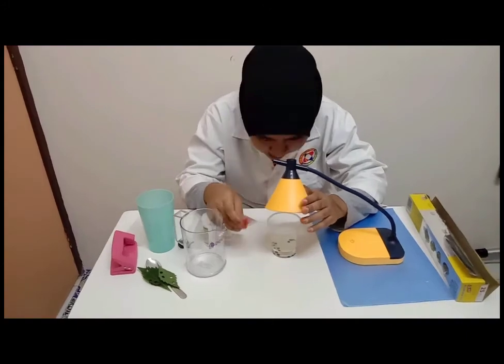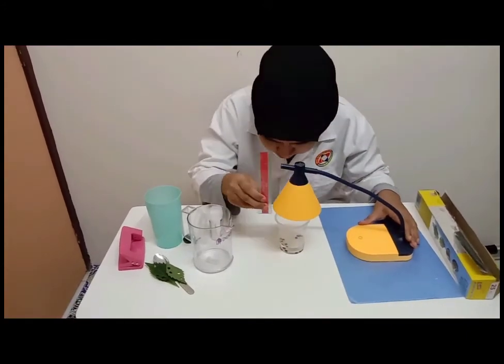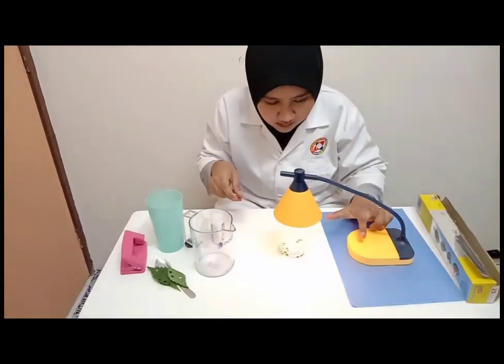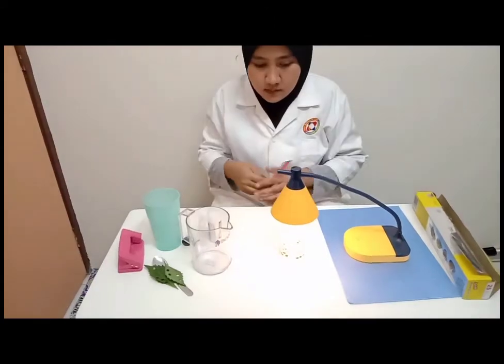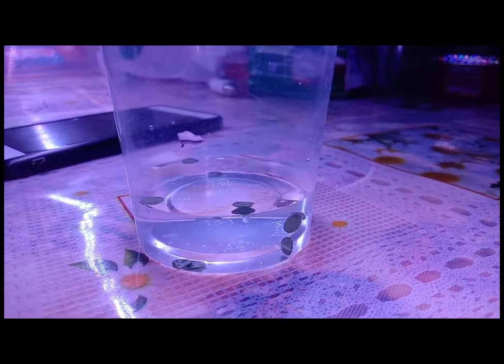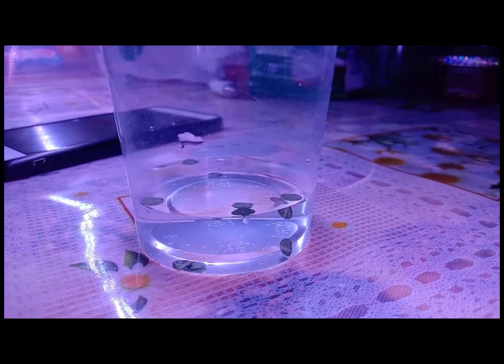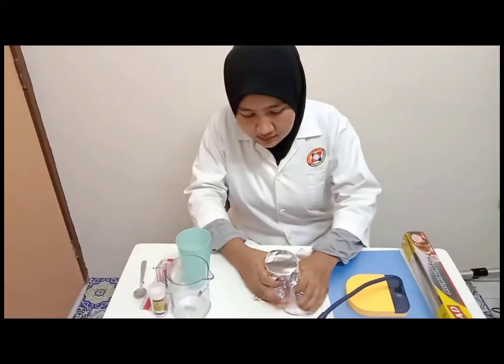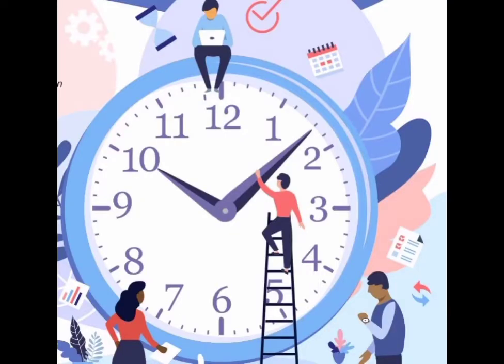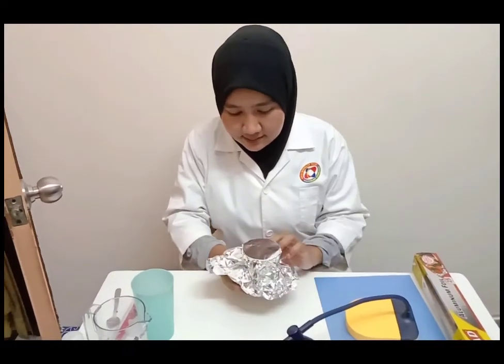The torchlight is set up so that it is suspended about 3 cm above the beaker. Turn on the light and start a timer. Watch the leaf discs at the bottom of the cup and record the observation, which is the floating of leaf discs, every minute until all the discs are floating. Once finished, the light is removed and the cup is covered with aluminium foil for 15 minutes. After the 15 minutes, remove the aluminium foil and see the observations.